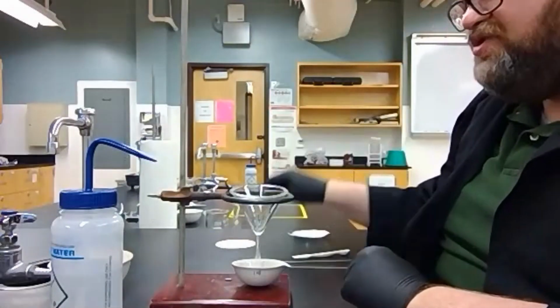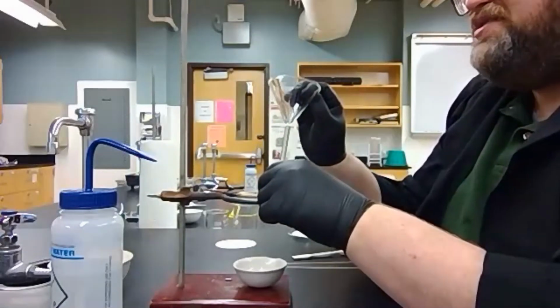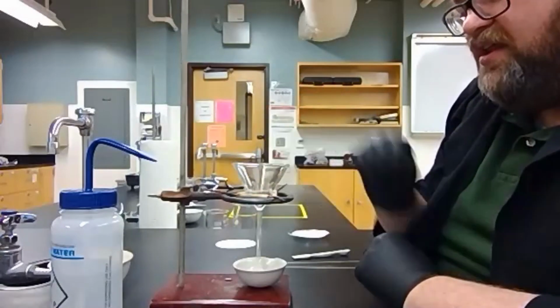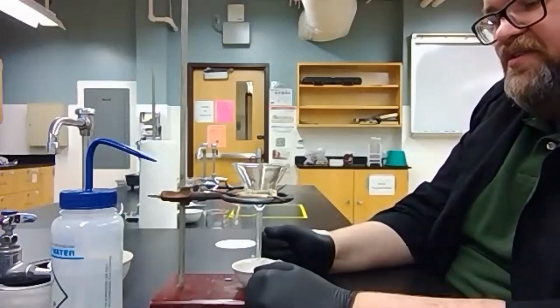So I can do better. I can use a clay triangle. I can put the clay triangle on top of the iron ring, and it makes the hole smaller so that my filter, my funnel, is suspended.